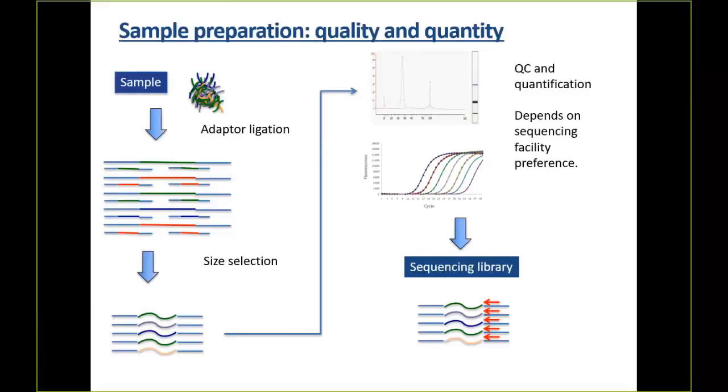Anybody done any of their own fragmenting? Mechanical is a really good one. So mechanical usually involves a sonicator, basically hitting it with high frequency sound. Some people also like to do chemical-based methods, although because enzymes tend to have their targets, you don't get random breakage, you tend to get breakage of specific sequence.